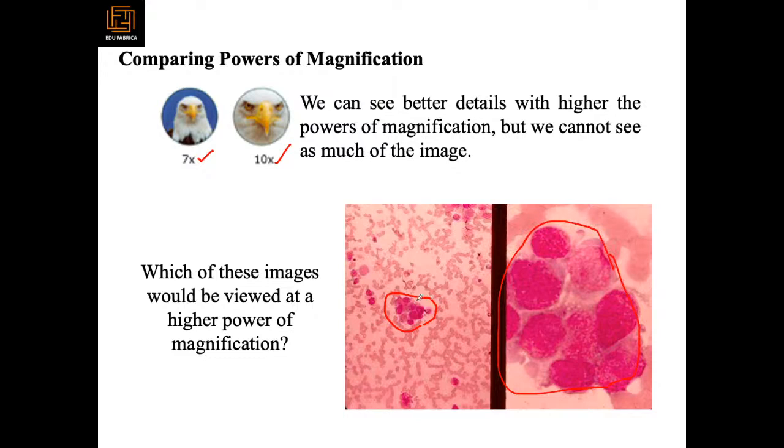So first you focus on something that you are looking for, then afterwards you go deeper into it and check the morphology, how the cells look. So the normal cells, if you see, they are very fine. There is nothing coarse like these. These cells are very broad. They are big, and they are more pinkish as compared to the other one. So this is the advantage of the magnification within the microscope.